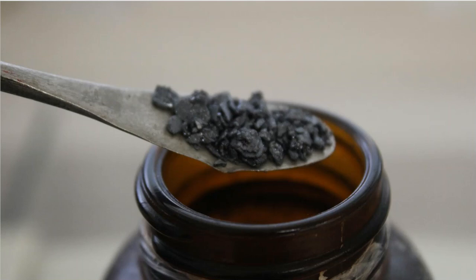I'll go to my iodine crystal, and this is what iodine crystal looks like. Folks, this is just I2. We've maybe talked about I2 in the past, maybe in general chemistry. These are true iodine crystals, and they are beautiful, by the way, because when you put a small amount of heat on them, they turn into a wonderful purple gas. Then they condense back down into a very dark, deep, charcoal-looking crystal again. So it's a great demonstration in a lab if you ever get your hands on some iodine crystal.